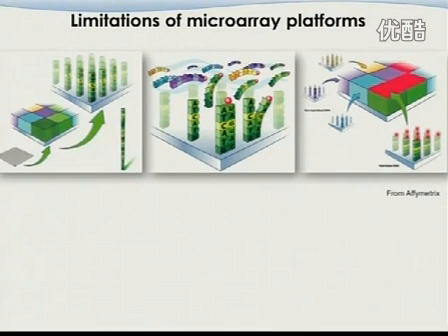If we zoom in on this area, this is what it will look like. In one compartment, there are a lot of small oligos standing there, and they are all the same. They are designed to target a certain gene, meaning they are reverse complementary to the RNA molecules in those regions. This is the array design.